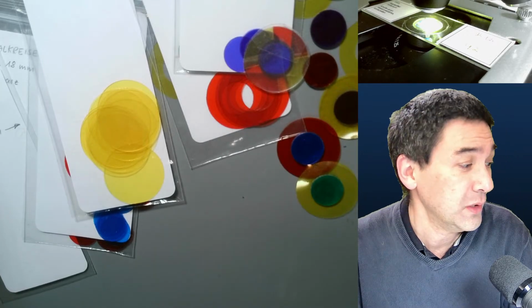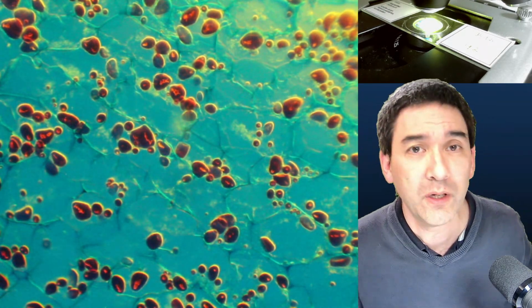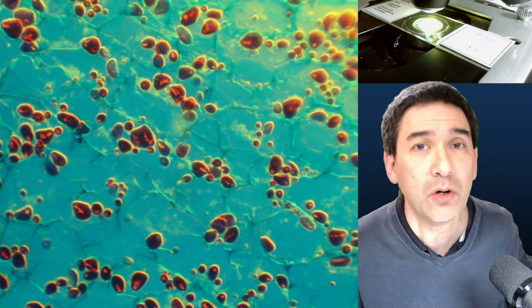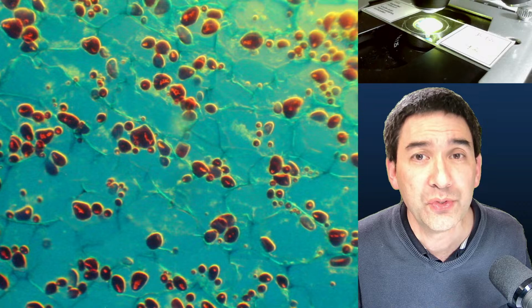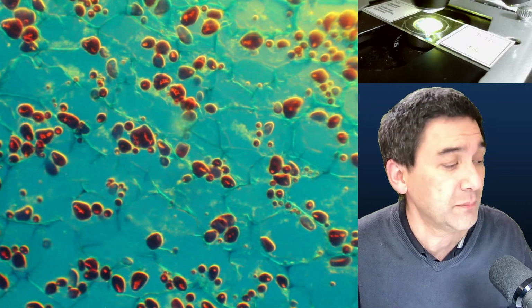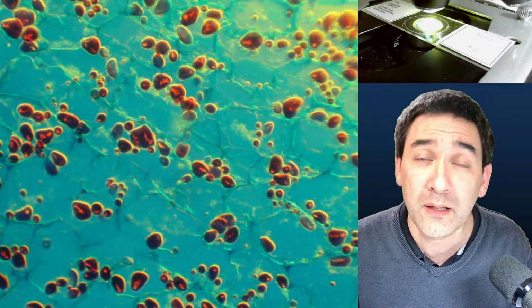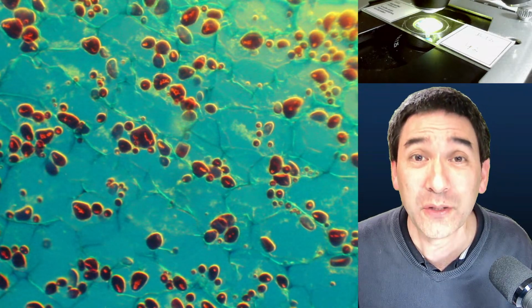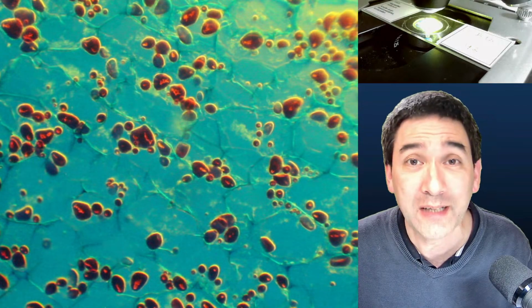Okay, so what I'm going to do here is I'm going to quickly show you this one over here before I show you some of the filters. These here are starch grains from a potato. And I've now used a filter here, and if you've already watched last week's video, I also was playing around a little bit with filters, with dark field filters and oblique illumination. But today I'm going to add a little bit more color.